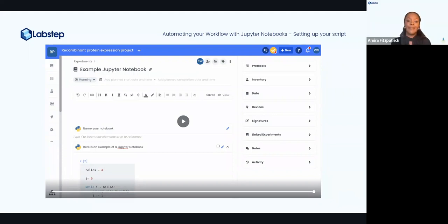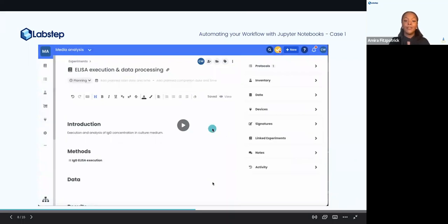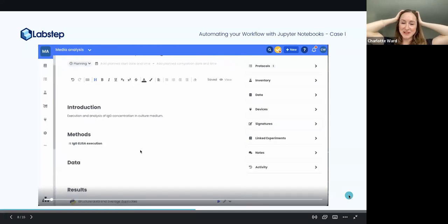Very cool. So, I mean, as much as 4 hellos is really cool, let's see some use case examples. So do you want me to press play on this now? Are you ready? Yes, please. Yes. So great. Thank you, Amira.